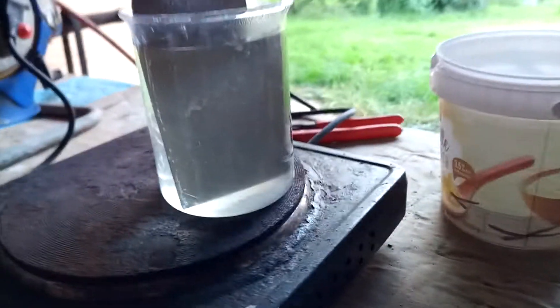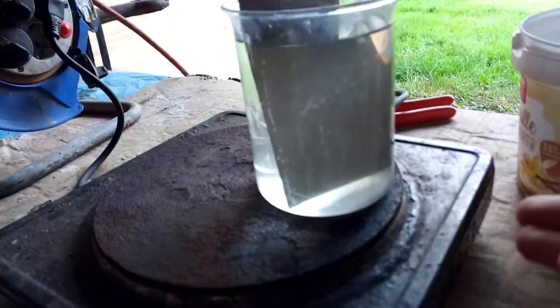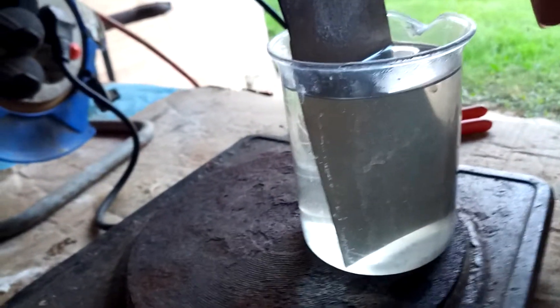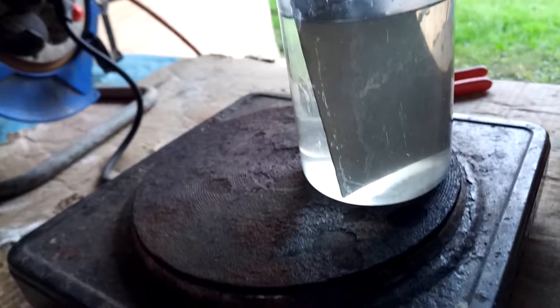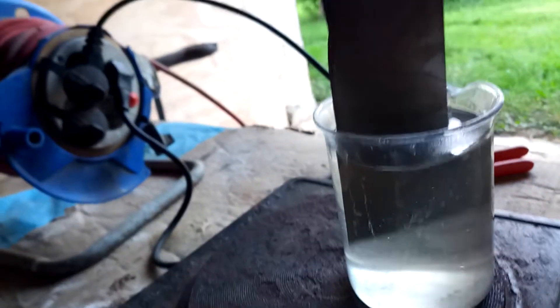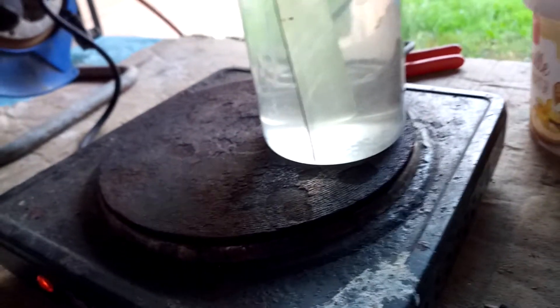And that's if we just apply some electricity — apparently if we run some current through this and use the titanium as a cathode, as the negative, not as the positive, we can somehow reduce that oxide layer that's on there and still get it etching in that solution.